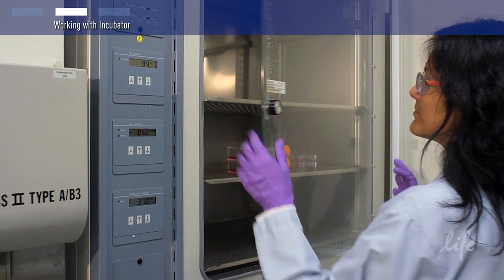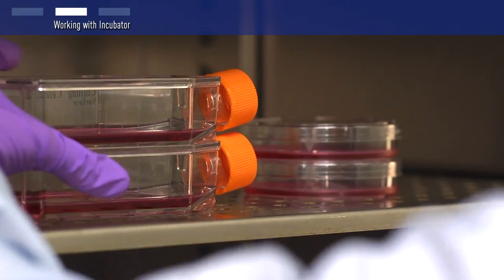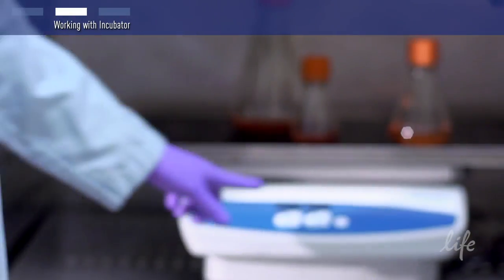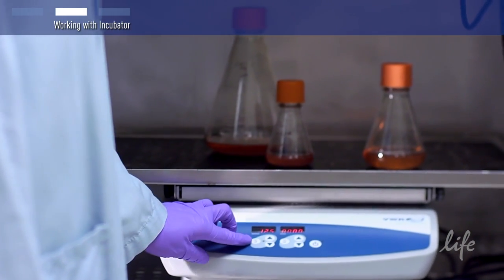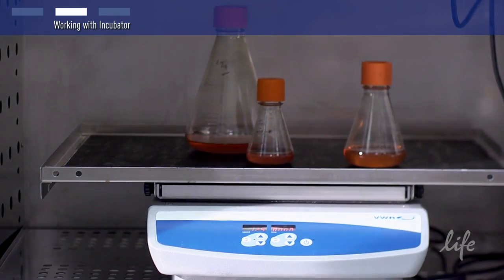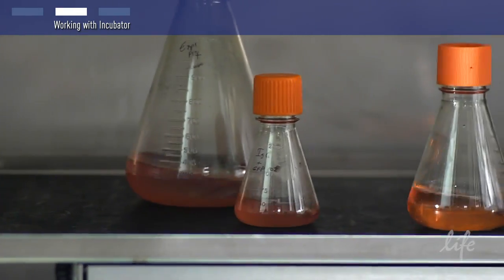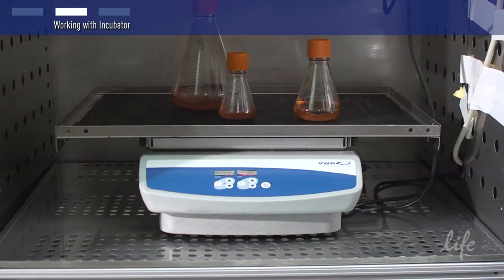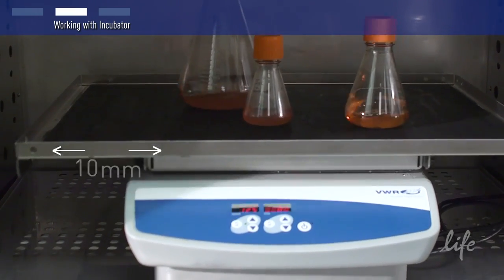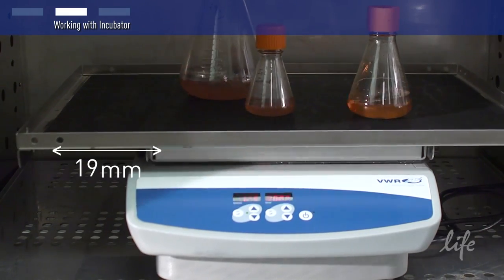For traditional adherent cell cultures, you can use T-flasks or other tissue culture-treated dishes in this type of incubator. Larger scale protein expression is typically done in suspension culture systems, and for this type of work you will need a shaker platform. The shaking motion will keep suspension-adapted cells in suspension and will also ensure proper gas exchange. Many protocols are based on a shaker platform with an orbit or horizontal throw of 0.75 inches or 19 millimeters.